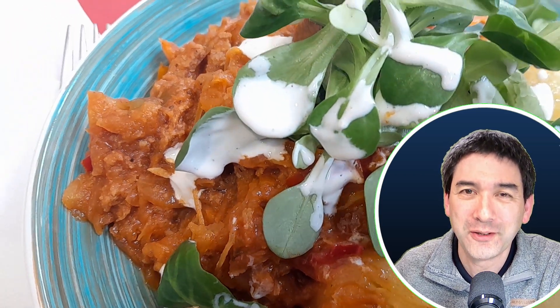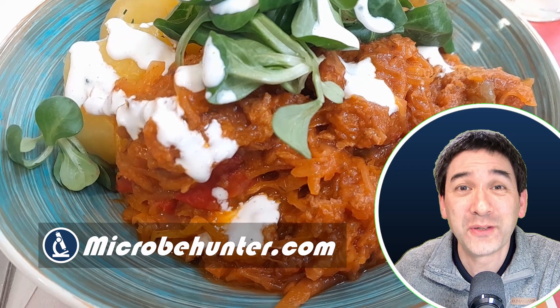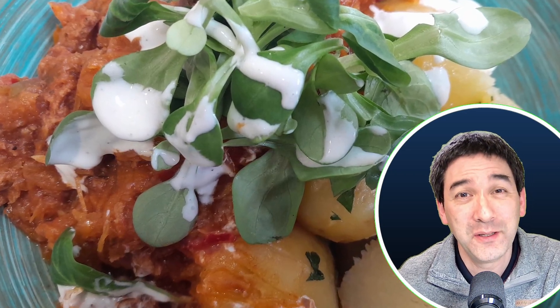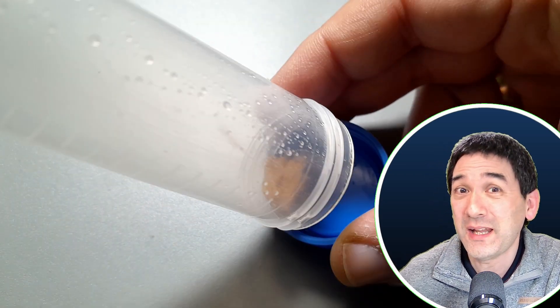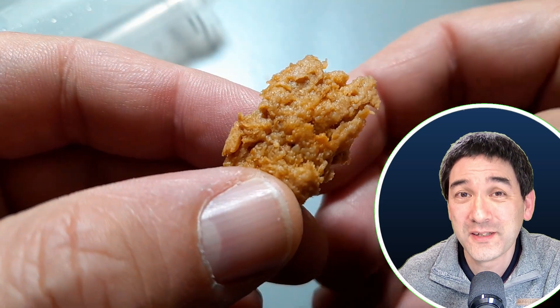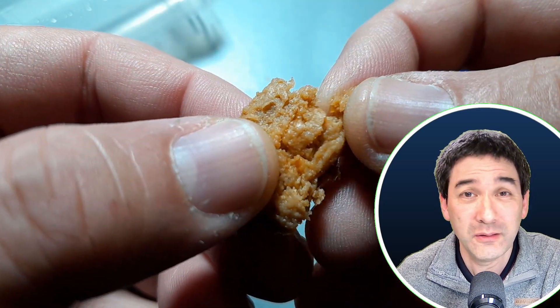Hi, hello and welcome. Microbe Hunter here. Today I would like to put some food under the microscope, but it's not just any type of food. A few days ago I went to a local cafeteria and for the first time in my life I tried to eat vegan meat. And maybe it's also the last time, because I did find a few things in the vegan meat that I did not like so much. The food itself was pretty good — it tasted like chicken and quite spicy. I took a small sample of the vegan meat home. This is how it looks; it looks quite almost like real meat, like chicken almost.